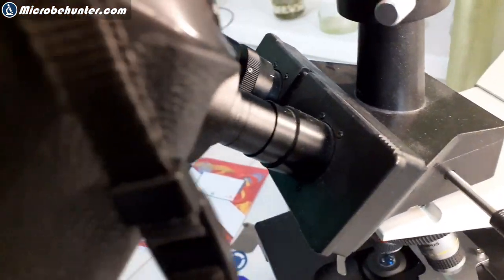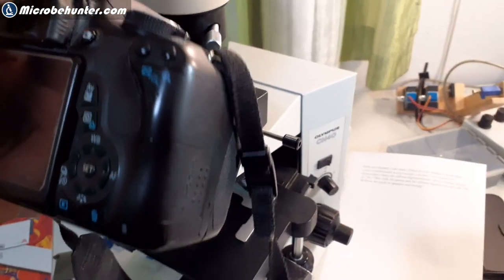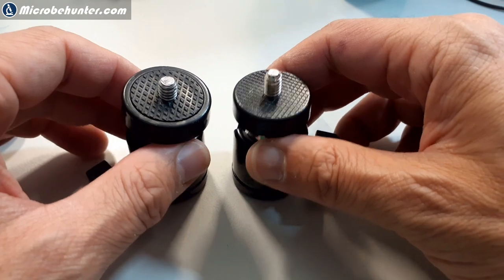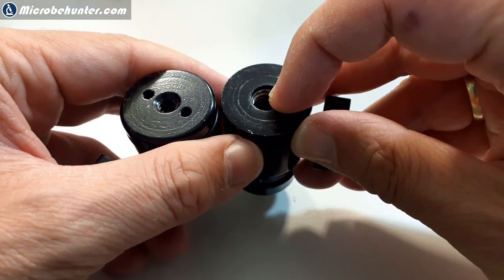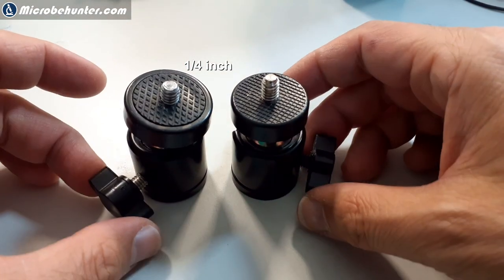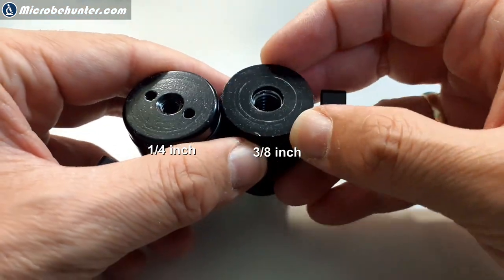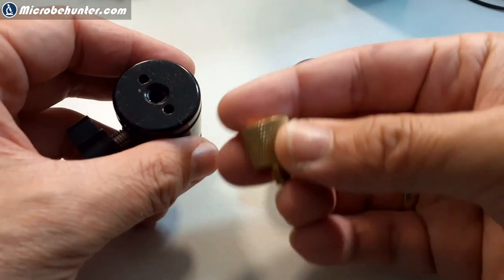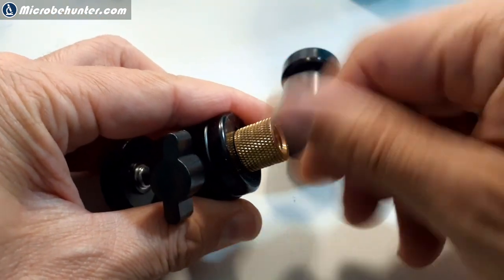Right now I'm connecting it directly to the eyepiece of my compound microscope — it's also stable enough but likes to turn. I ordered those ball heads twice and got two different products, so be careful. The left one has a 1/4-inch connector and the right one has a 3/8-inch connector on the bottom. So I wasn't always able to mount it to the microphone stand — only the right one worked, even though they were supposed to be the same product.